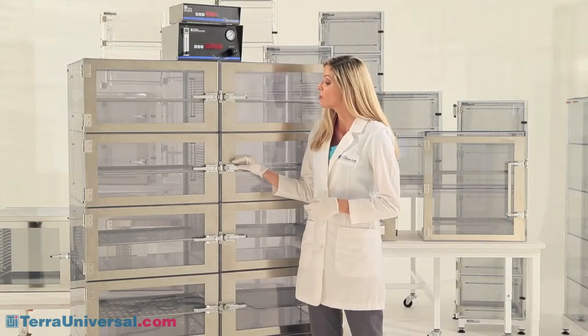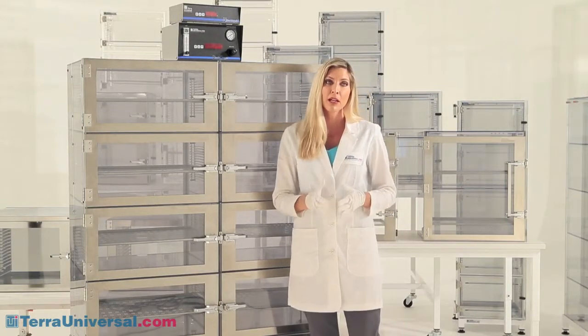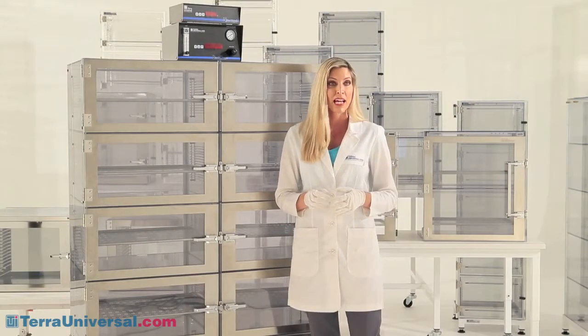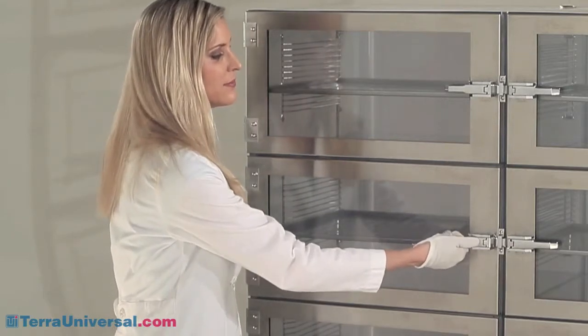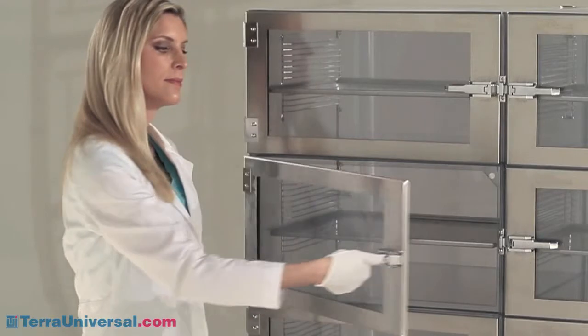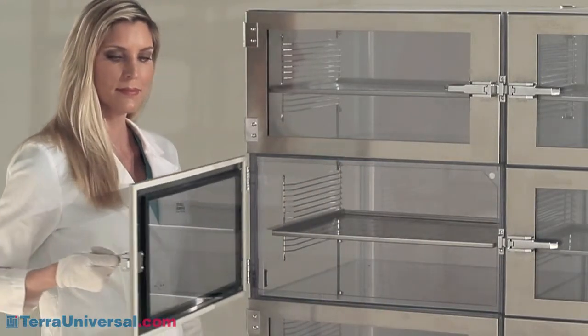The ergonomic lift latch design eliminates lateral strain on hinges as well as the metal-on-metal contact inside the chamber, which is common with rotary twist-style latches. Terra's standard desiccator lift latches are chrome-plated, but 100% all 304 or 316 stainless steel upgrade latches are available for the most contamination-sensitive requirements.